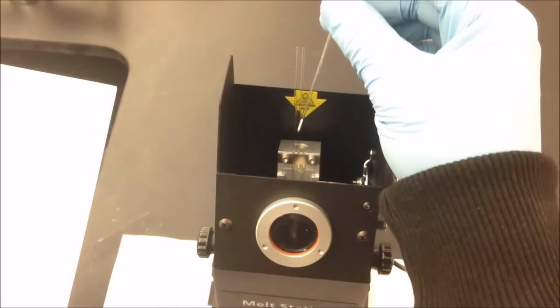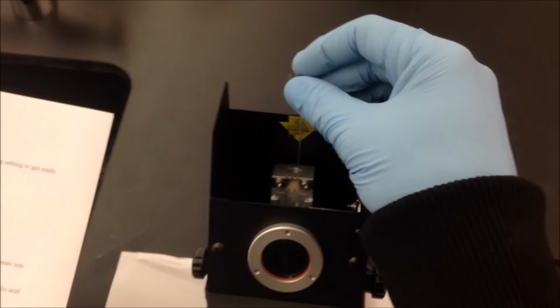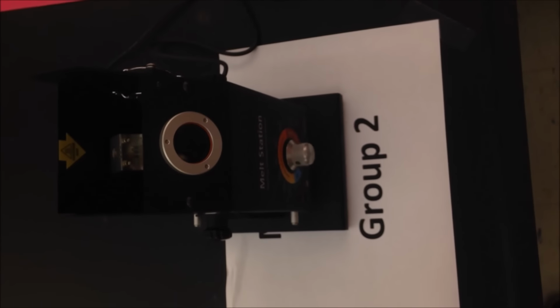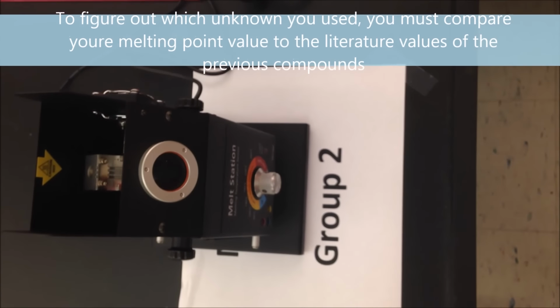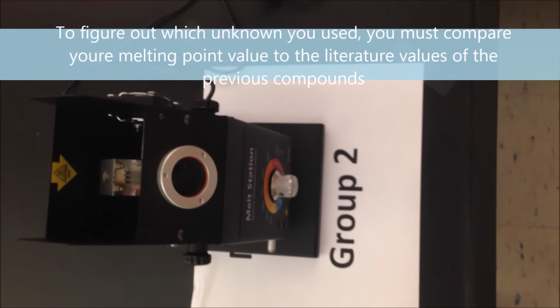Record the melting point range of each sample and determine the identity of your sample. If the apparatus was calibrated correctly, the melting point closest to the original temperatures recorded would help you determine which unknown is which.